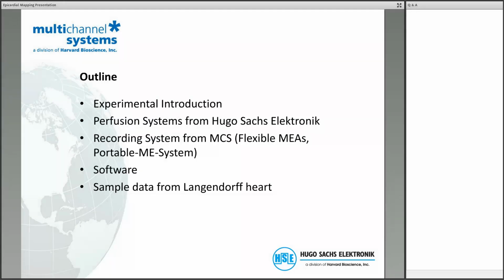I would like to introduce you to the systems that are provided by Hugo Sachs Electronics. And in the third step, I will talk about our components from Multi Channel Systems, namely the flexible MEA, the portable ME system. And then in the next part of my presentation, I'm going to talk about the software. And in the last part, I'm going to show you some data that we recorded in various labs.